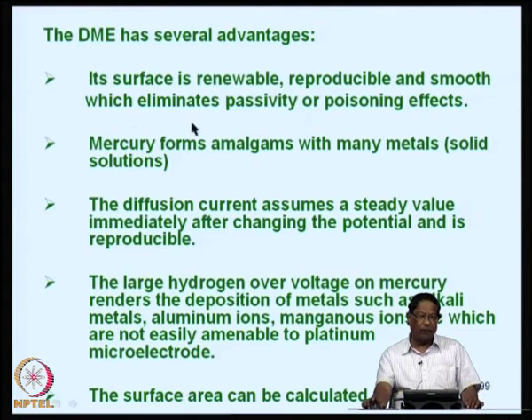And then the diffusion current assumes a steady value immediately after changing the potential. That means I am physically changing the applied potential and determining the current. The moment I change the potential, the electrode takes the potential I apply immediately without any time lag, and it is reproducible.